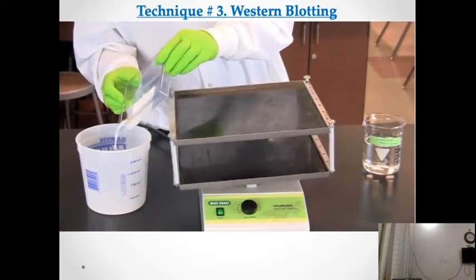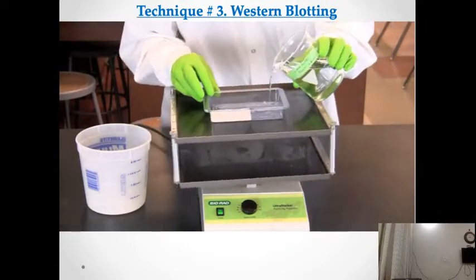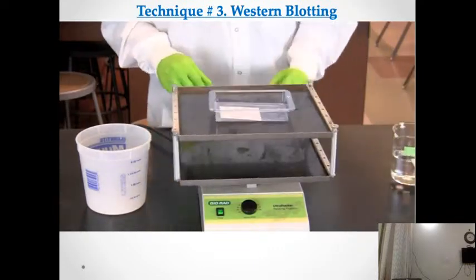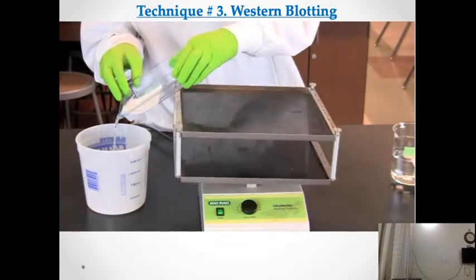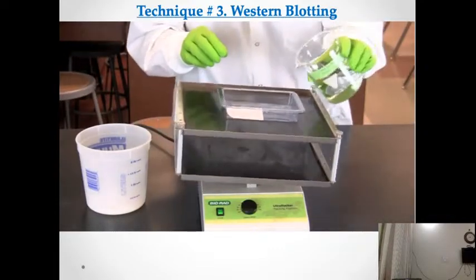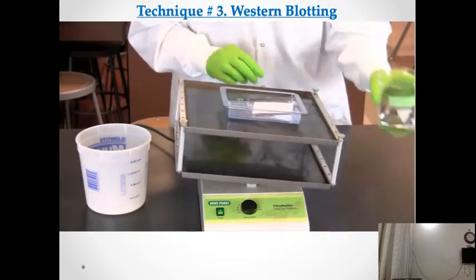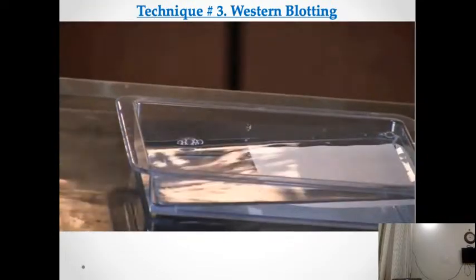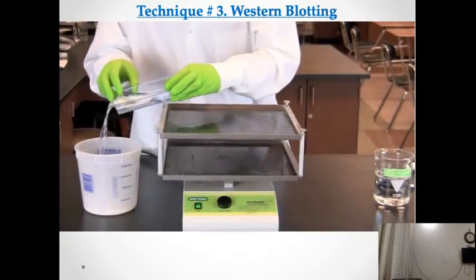Pour off the primary antibody. Rinse the membrane quickly in 50 milliliters of wash buffer, and then discard the wash buffer. Add another 50 milliliters of wash buffer to the membrane and let it wash for 3 minutes on the rocking platform at a medium speed setting. Discard the wash buffer.